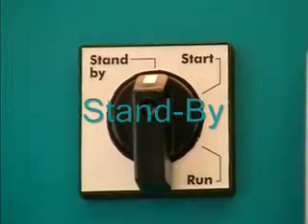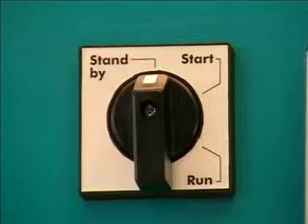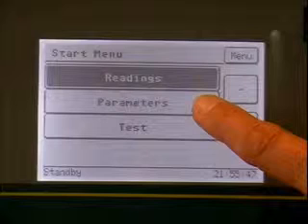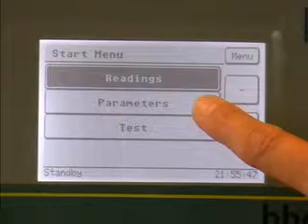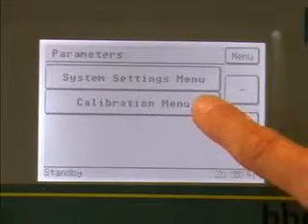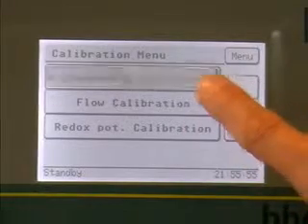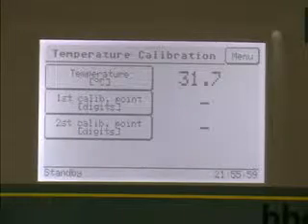The Standby mode is used for checks and maintenance, changes in parameters and calibration. For example, the sensors for flow rate, temperature and chlorination should be initially calibrated according to the manual. To recalibrate the temperature, enter the Parameters menu, scroll down to the Calibration menu and enter the Temperature calibration menu. Here, the user can recalibrate the two temperature reference points.